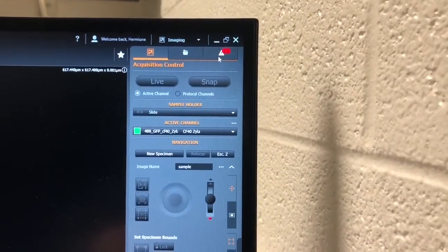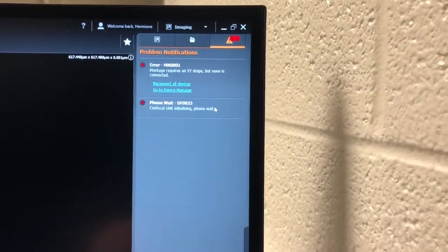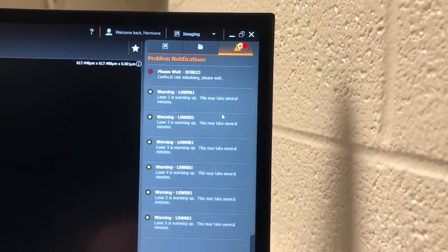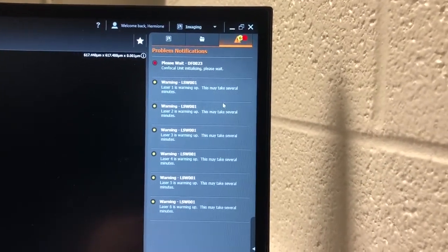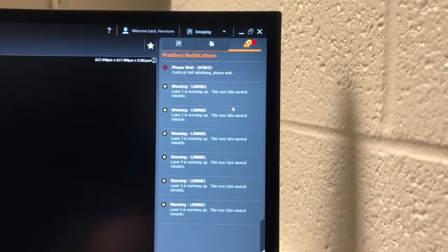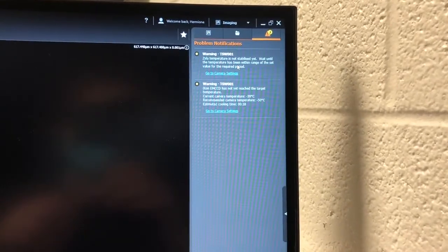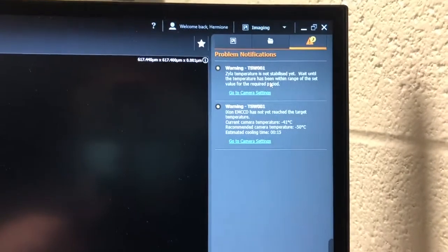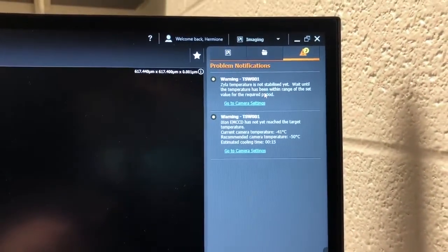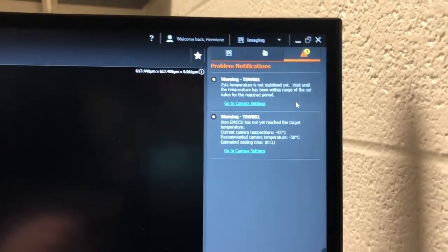The error messages will show up in this panel here. At the beginning there are messages describing how the software can't connect to various things, then laser warming messages, and then camera cooling messages — all of those are perfectly normal. Once the software has finished loading, the last messages that remain are about camera temperatures. You can ignore those and get started; while you work, the temperatures of both cameras will stabilize.